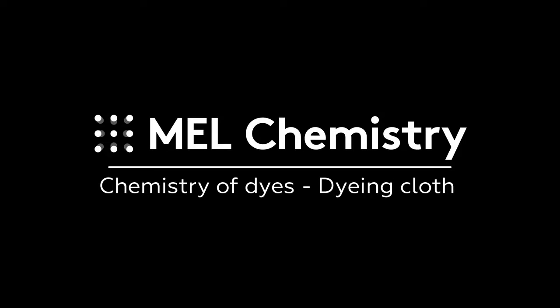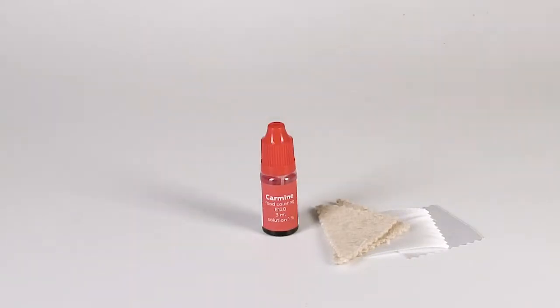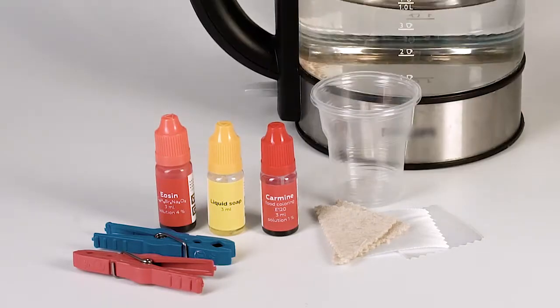For the experiment Dyeing Cloth, we will need two pieces of polyester, two pieces of wool, carmine, liquid soap, eosin, two clothespins, two plastic cups and boiling water.